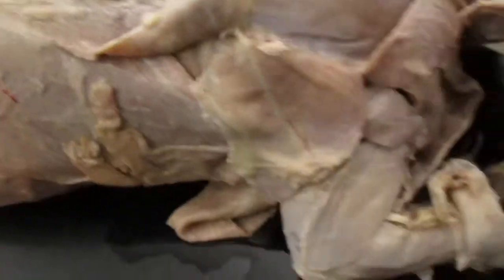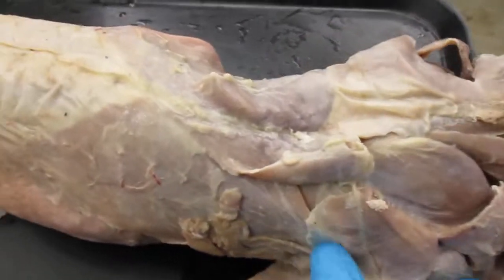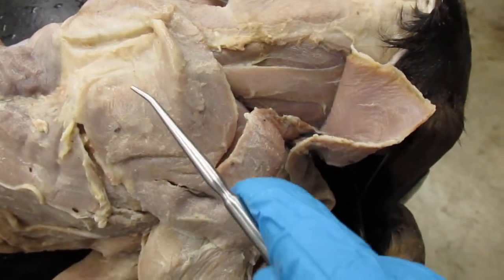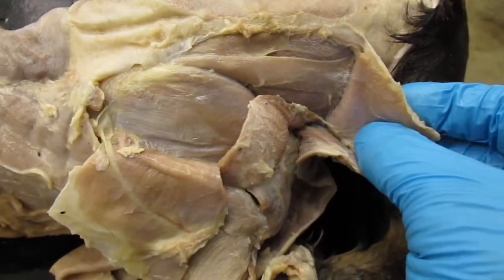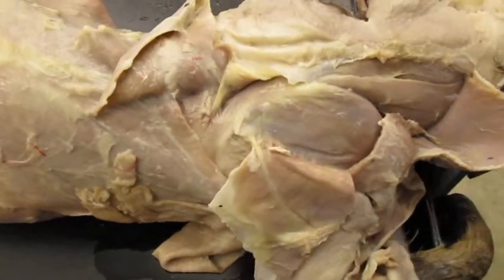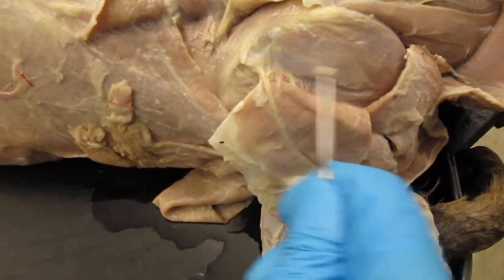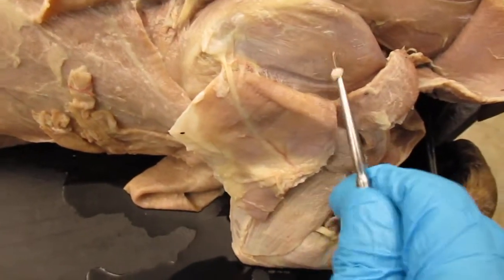So we can see on this other side here, I have cut the acromial trapezius and reflected it back. I've cut a little bit of the clavotrapezius, and I've cut through the spinal trapezius. So right here you can see the supraspinatus is right here. Hopefully you can see that.